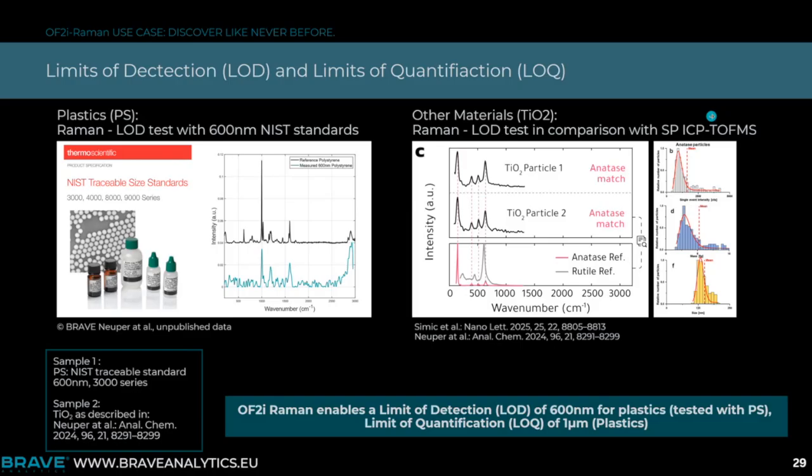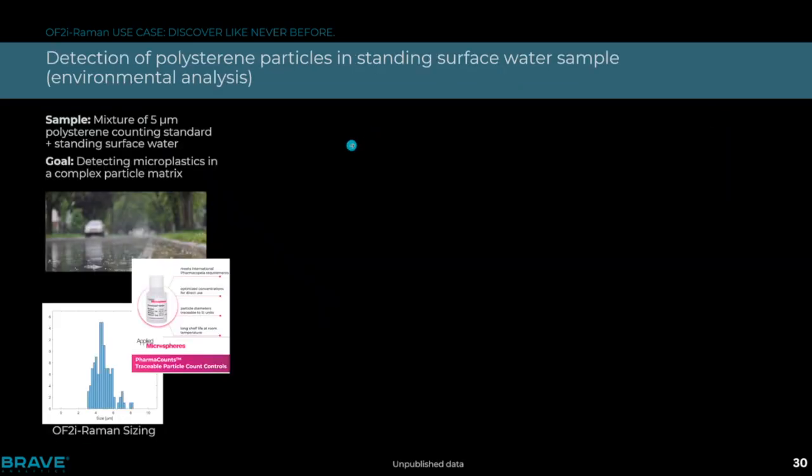One of the exciting things is that we now knew we can measure particles. We can use the technology to scan and differentiate particles, but you really need to know how many particles you find, so the recovery rate is really important. Coming from pharmaceuticals, you always need some kind of performance qualification, and we knew that pharma counts exist. There is a clear count standard where a certain concentration per volume is in there, and we used this sample to spike.